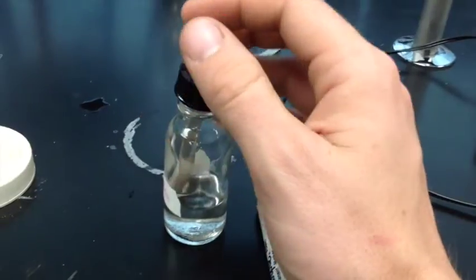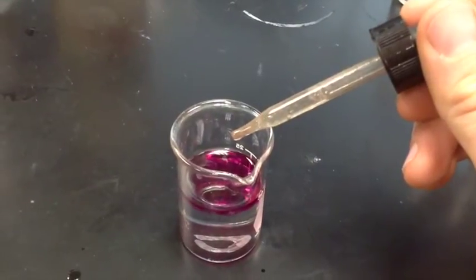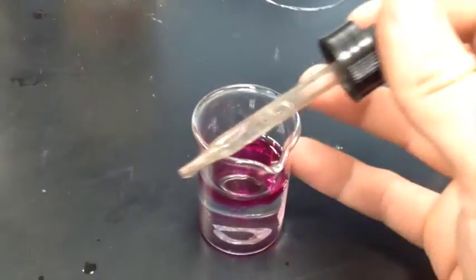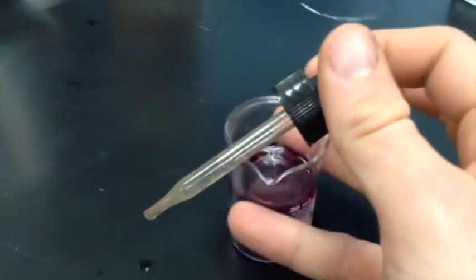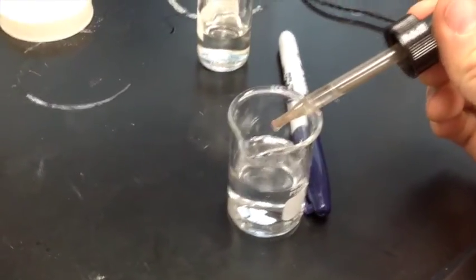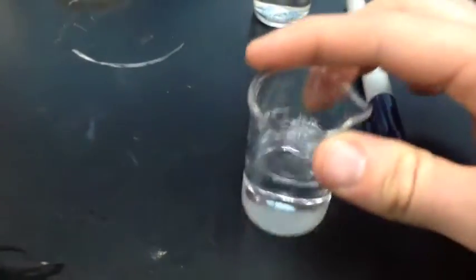Now, phenolphthalein has one really unique property. In certain solutions here, it turns them deeply purple. Kind of cool, very pretty color change. This has to be a base. When something stains phenolphthalein like this, that's a base. Contrarily, in an acid, it does nothing. You can see it's white there. That's the phenolphthalein, the solid, in the water, but nothing.